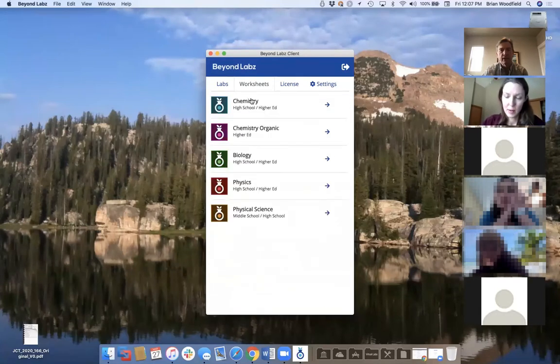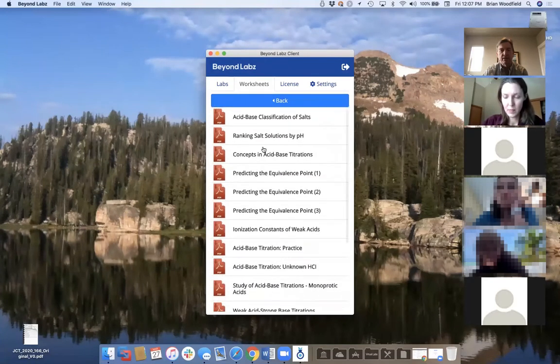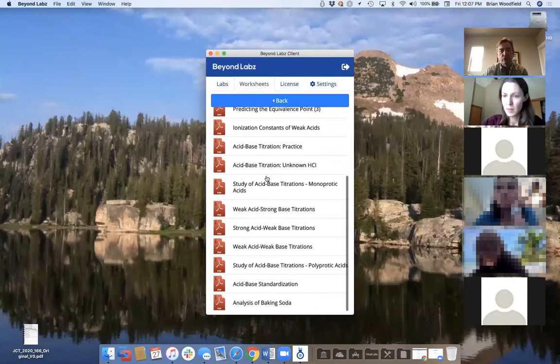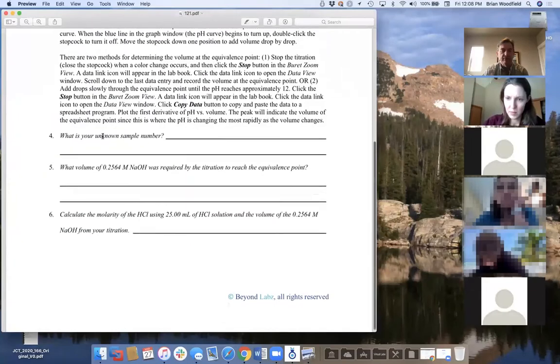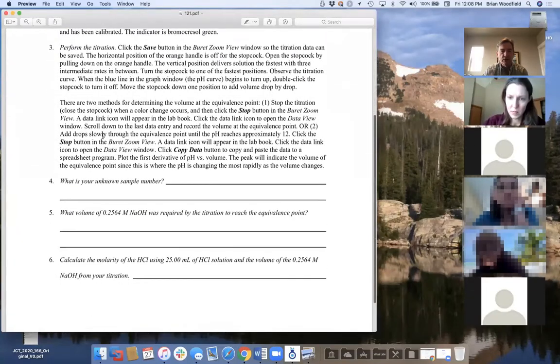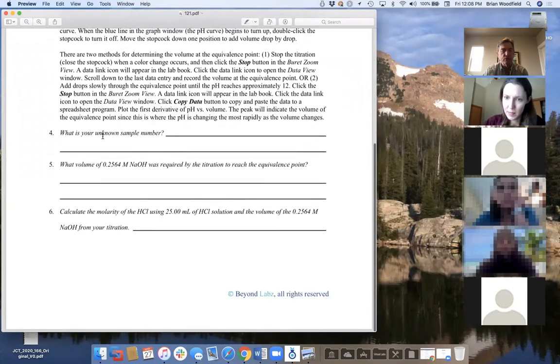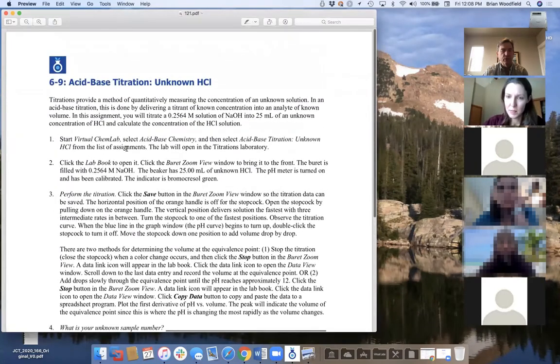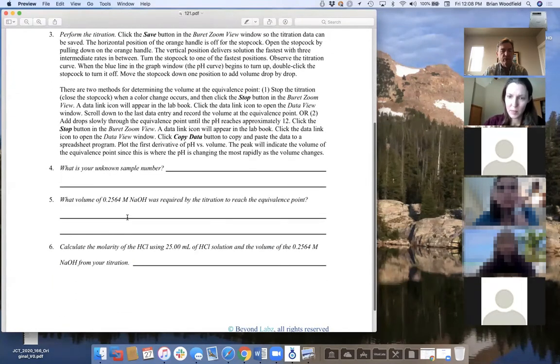In higher ed chemistry, if you want to do a titration, you'd go to acid-base chemistry and see a wide variety of activities — from really low-level highly structured activities to unknowns and high-level ones where we don't give a lot of instructions. You just click on a worksheet and it brings up a PDF with step-by-step instructions. These worksheets are a great way to learn how to use the labs. A high-end worksheet might just give them an unknown and have them report what it is.